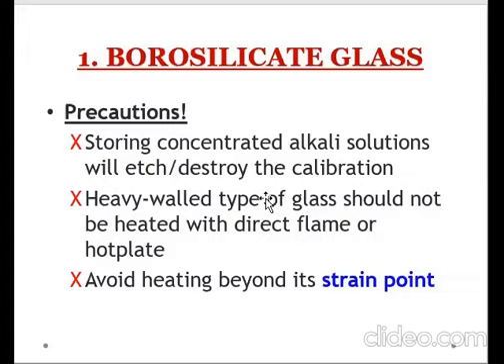The second precaution, heavy walled type of glass should not be heated with direct flame or hot plate. Sir, bakit hindi siya pwedeng gamitin kapag nagpapainit tayo ng liquid? For example, na sinabi mo kanina na yung borosilicate glass, malaki yung kanyang mechanical strength, and then na-retain niya yung kanyang heat resistance. Yes, sinabi doon na-retain yung kanyang heat resistance. But again, makapal na po yung wall ng glass. So, hindi madali para sa kanya to adjust to the changes in temperature later on.